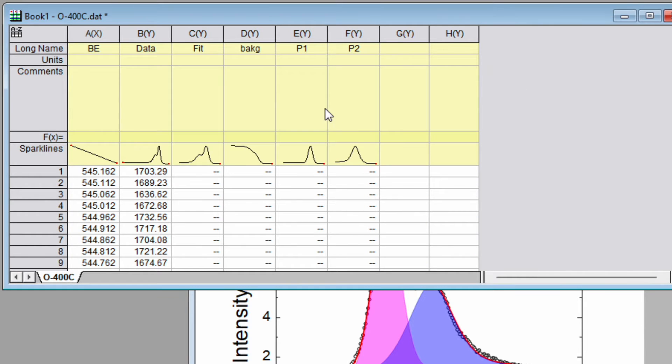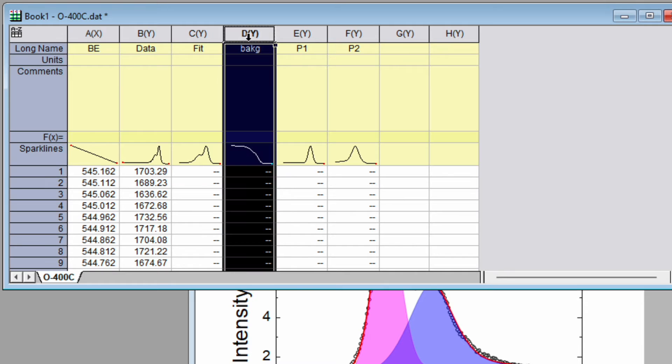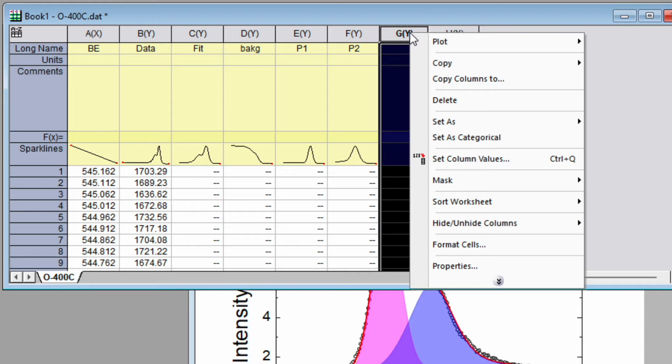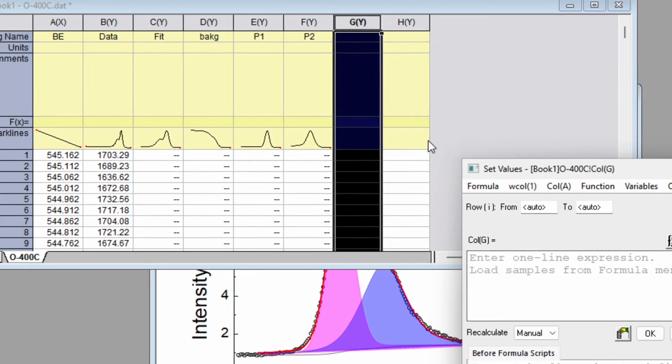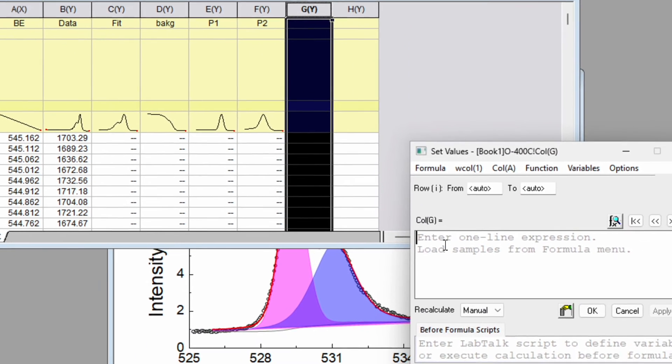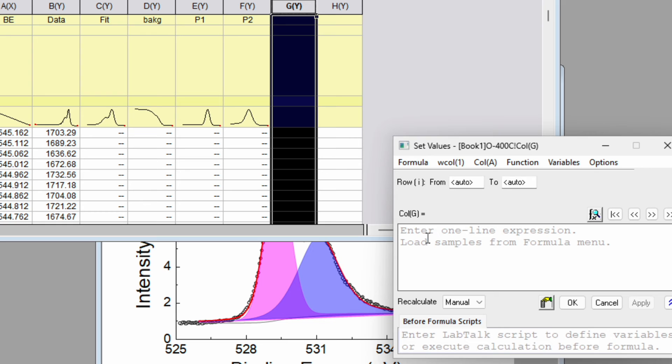Here this is the background, so we need to subtract background from p1 and p2 first. Click and select the column, set column values. Then this is column G. Column G is equal to column E minus column D. So write down this function and apply.